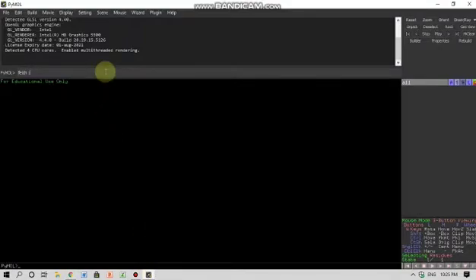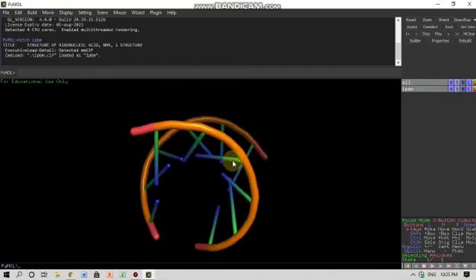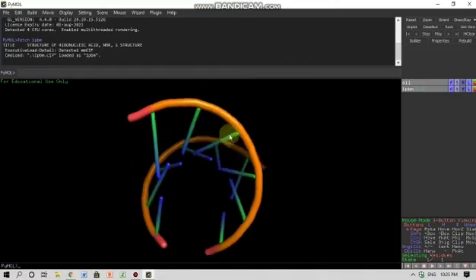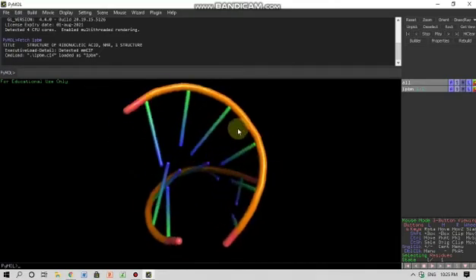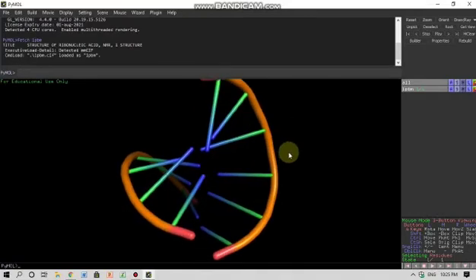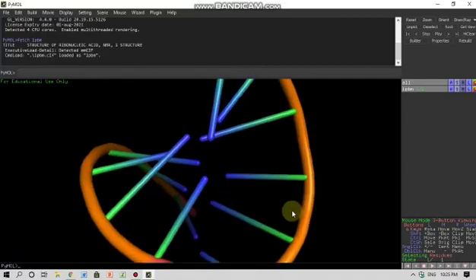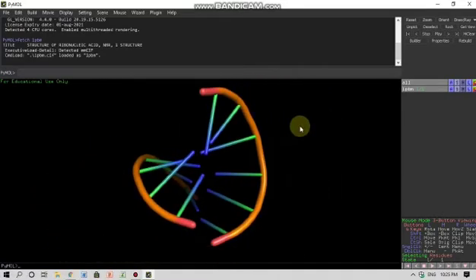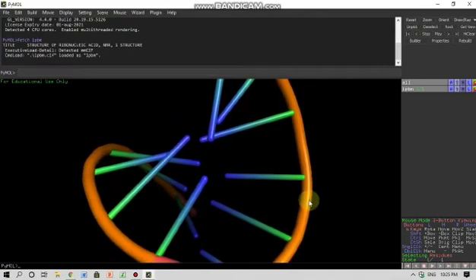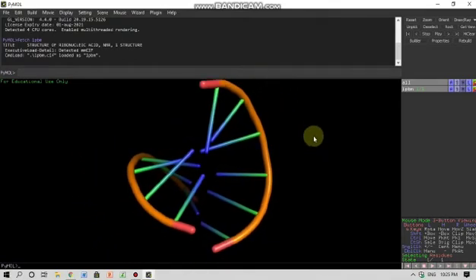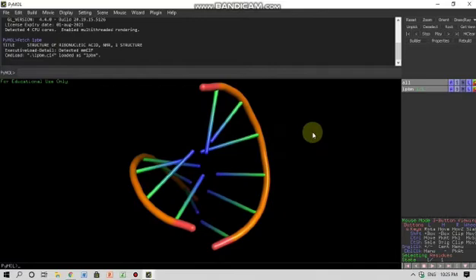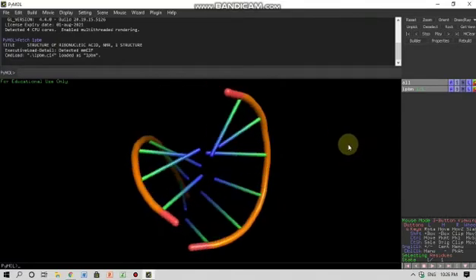So this is the RNA molecule. I can use the mouse by clicking on the right button. It will start to zoom in and zoom out. If I go towards the keyboard then it will start to zoom, and if I go towards the end of my writing pad it will zoom out. By clicking on the left I can rotate this molecule.